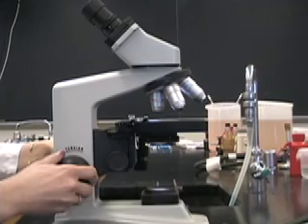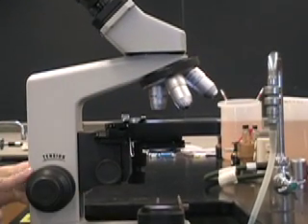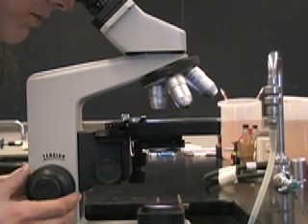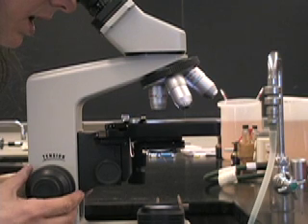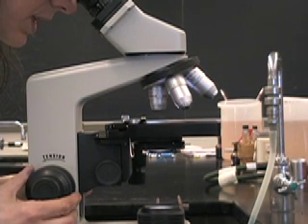Raise the stage of the scope up as far as possible using your course adjustment knob. Look through the ocular lenses and turn the course adjustment knob until the dye you see is clear.